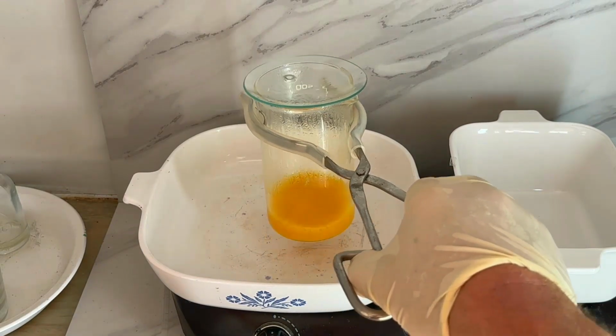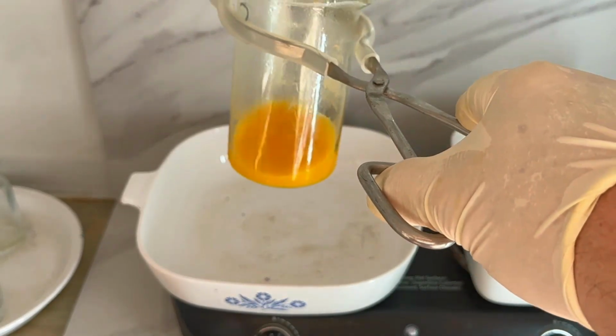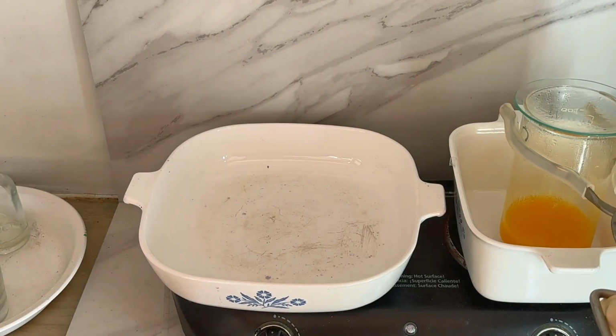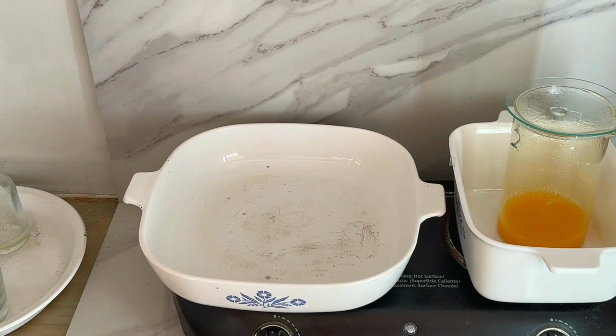The reaction seems complete. We have no more solids. Fumes have basically stopped producing. I think we are ready to move on to the next step. So we'll set this over here, let it cool just a little bit.